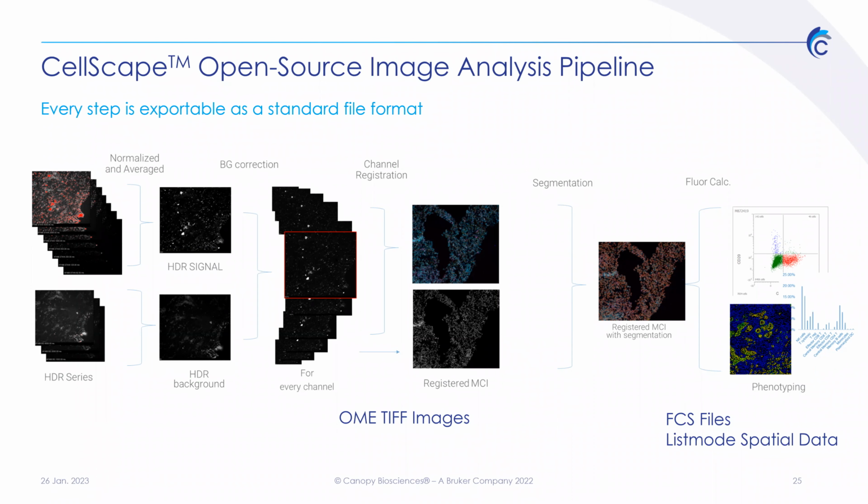So there isn't a Canopy file format, it's just OME-TIFFs. We also supplement that with our technical aides being able to support you in using that, at least to get the data into those programs. I'd say the second tier here is for people that are willing to pay for software and want it to be easy to use.